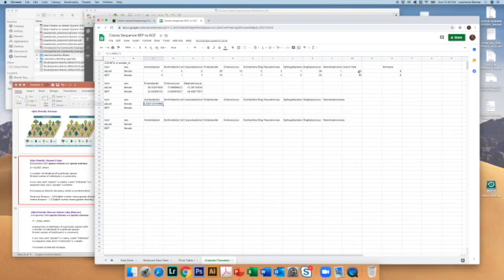Dragging across, it's having typed in that $, it keeps the value of the grand total the same for each calculation, which was what we want, but it will pick up the values of the abundance of each genus in that row. So click on this and just drag across, and it's doing the calculation for us. And then, once you've done that, then you can drag down. And by dragging down, it's picking up this other grand total, which is 49. We can prove that to ourselves by clicking in one of the cells, and we can see it's picking up M4 now, not M3.